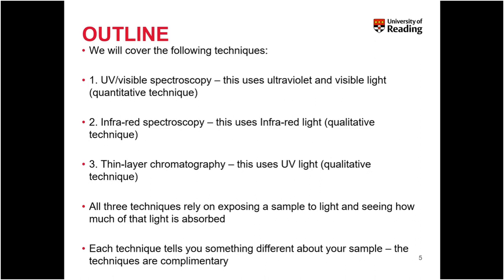Now, we'll also be looking at another technique called thin layer chromatography. This is a separation technique, so it allows us to separate mixtures of molecules. And we can do this in the lab. It doesn't use any specific equipment other than a UV light, and it lets you see how many components are present within a particular sample.